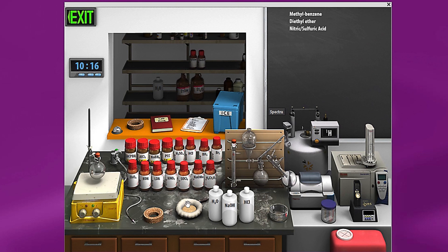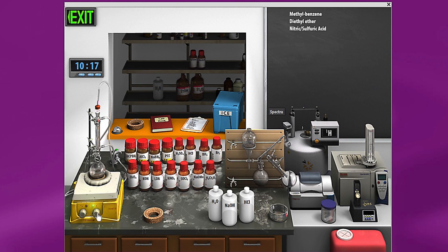Now that I've added my reagents, bring over my heater and my condenser, connect lab gas, nitrogen, and then begin the reaction.